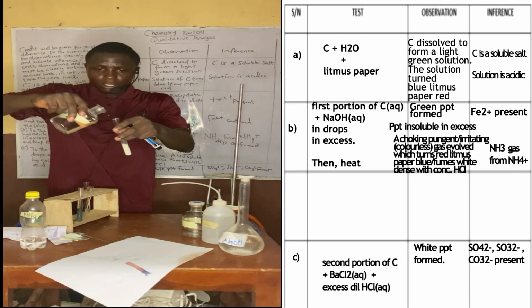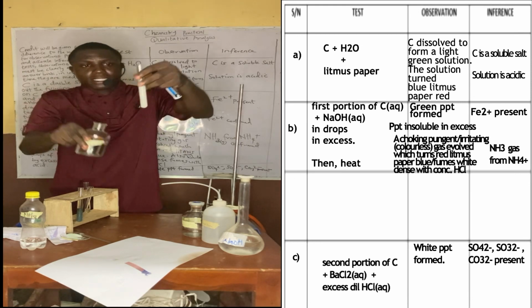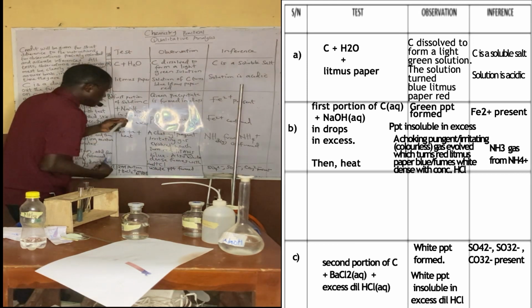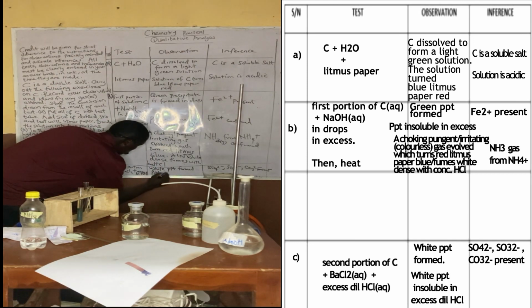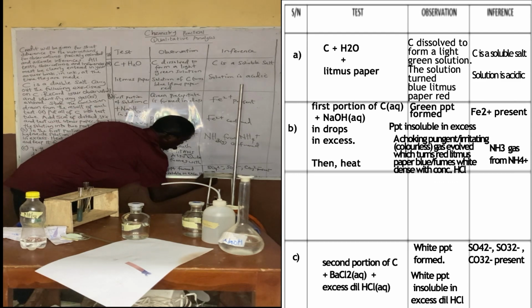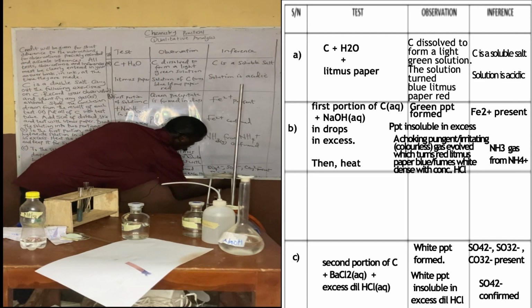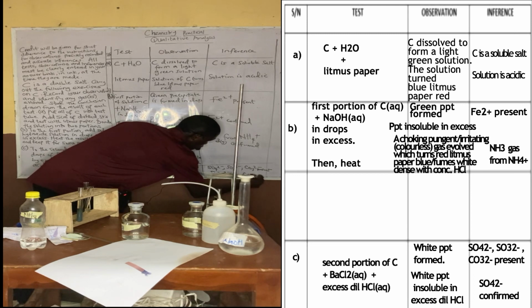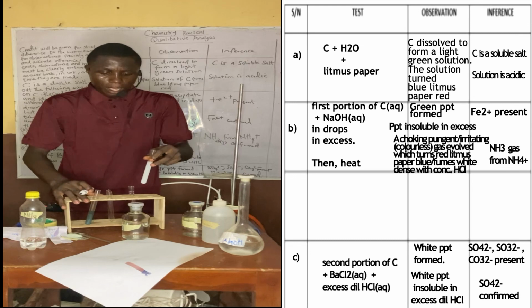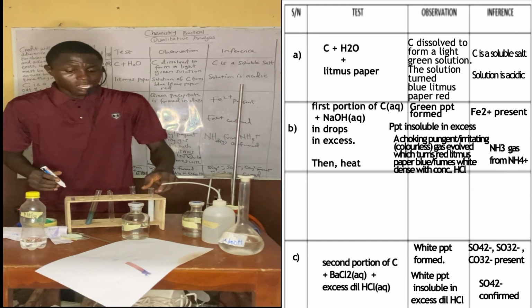Let's see what happens. You can see the white precipitate is insoluble in dilute HCl. So the precipitate is insoluble in excess HCl. What does that mean? It means that SO4 2- is confirmed. You can see the white precipitate is insoluble in excess HCl.